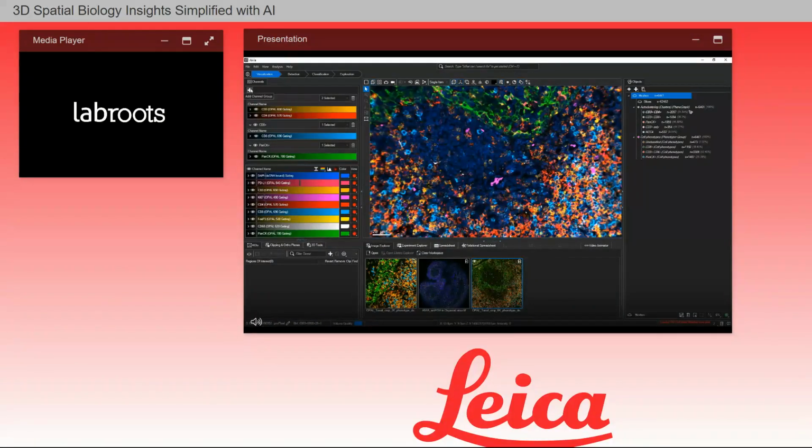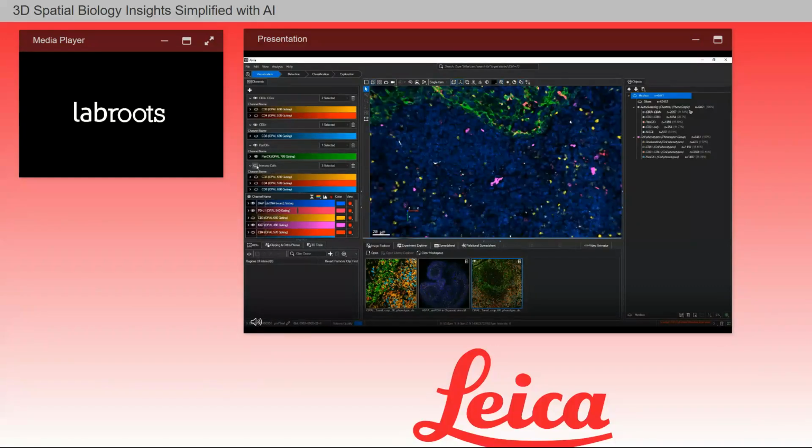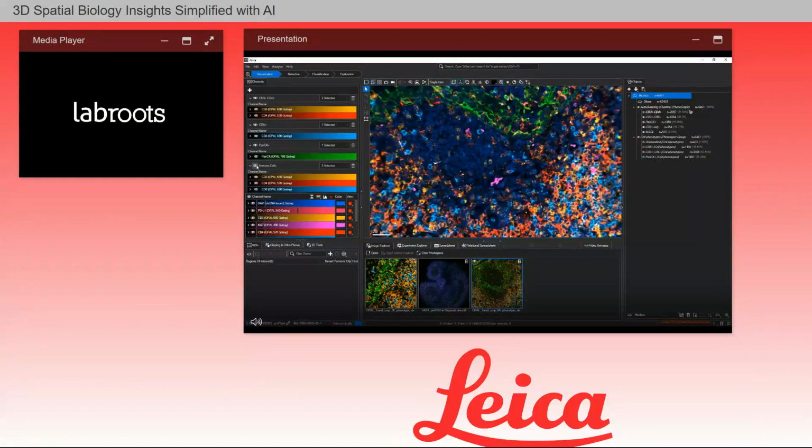To add a new group, click on the plus icon and define a group name. Since these groups are virtual, the data is not duplicated. You can have multiple groups sharing a set of channels, like I have here with CD3, CD4, and CD8 for this new immune cells group that I'm creating. We will come back to the channel grouping feature later, as there are more workflows that can be unlocked with this feature.